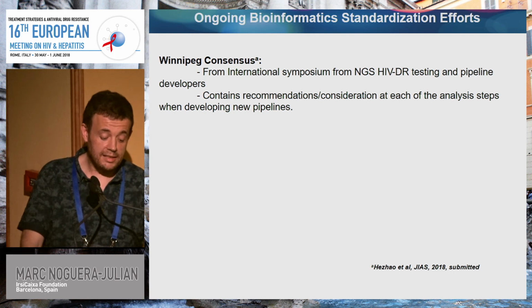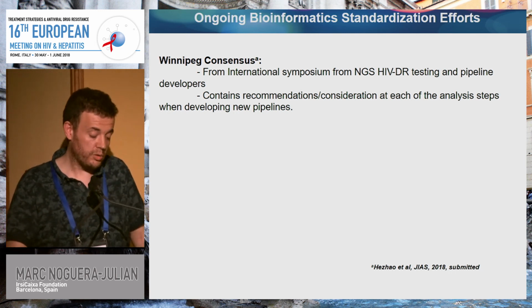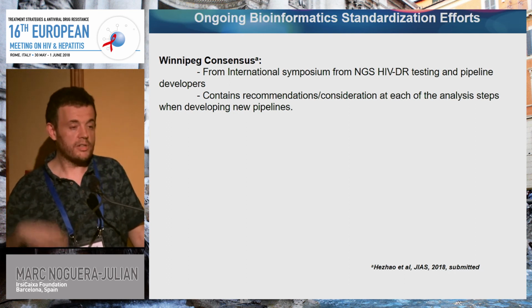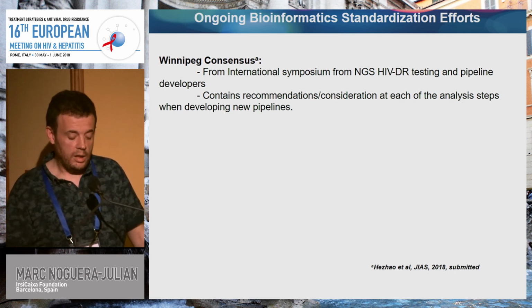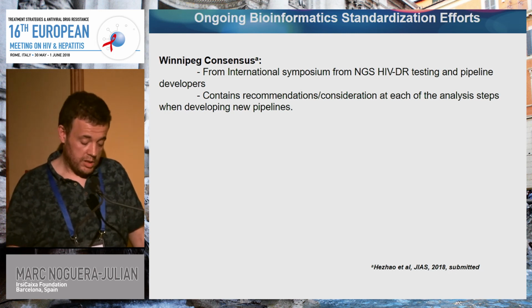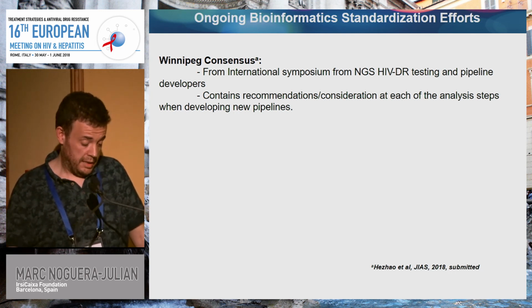And finally, just a slide on the efforts that are being done on standardizing the analysis and standardizing the outputs and the formats. The first one is from the Winnipeg Consensus, which is led by He Zhaoji in the Public Health Agency in Canada, in which we participate as well. It was a symposium that defined some recommendations, some suggestions on how future pipelines for analysis should proceed. So this is submitted now. It will be published sooner or later, I guess.